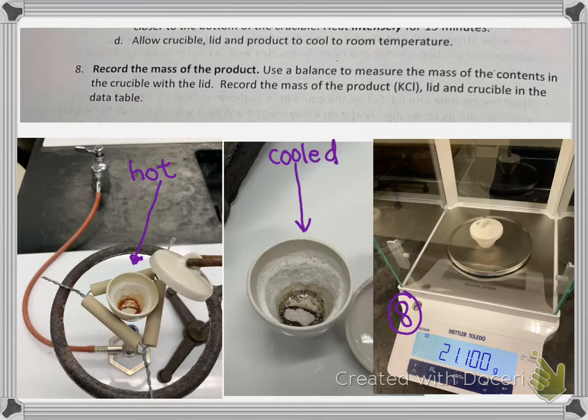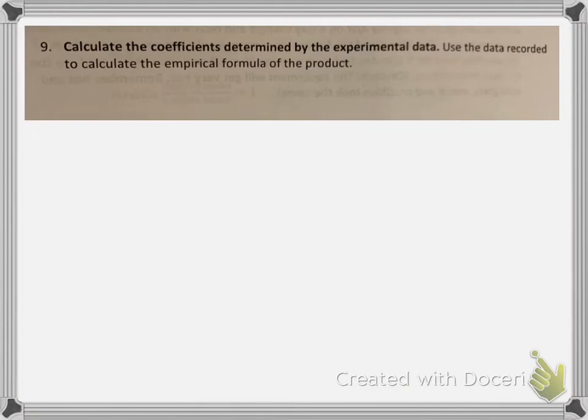And so this is the mass of the product, which is the potassium chloride. So this is the lid, the crucible, and the product, the potassium chloride, which is the product that remains. And so now with this number 8, you should have all 3 spots of your data recorded. And so then step 9 is to calculate the coefficients.